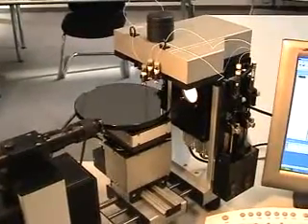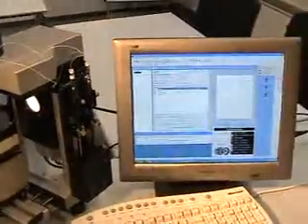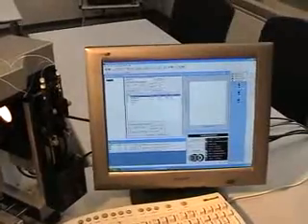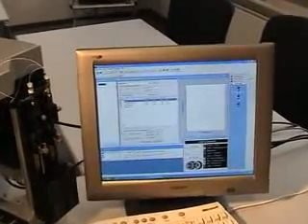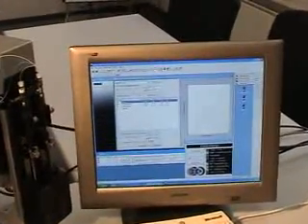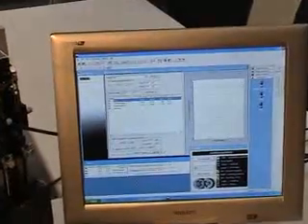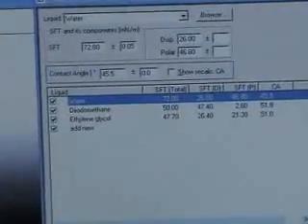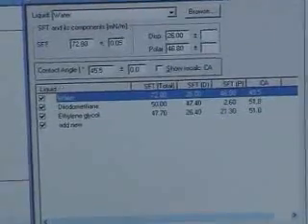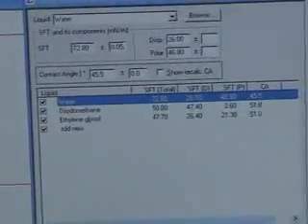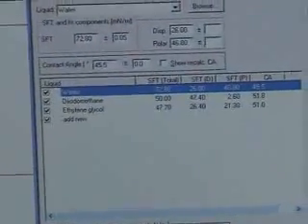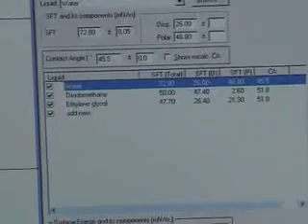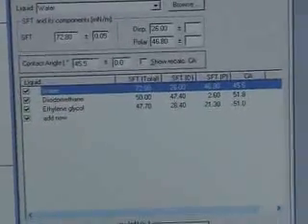During the measurement, automatically another window has been opened. This is the surface energy calculation window. We have to find three liquids to use for the surface free energy determination: water, diodomethane, and ethylene glycol.